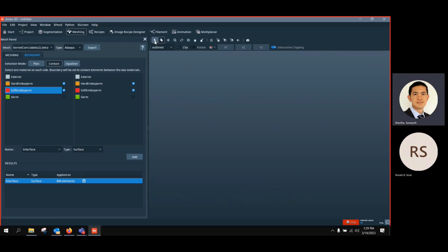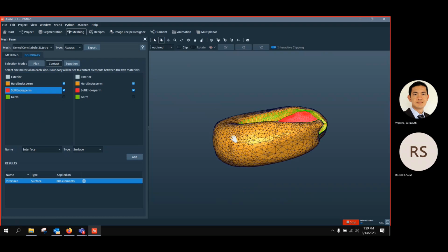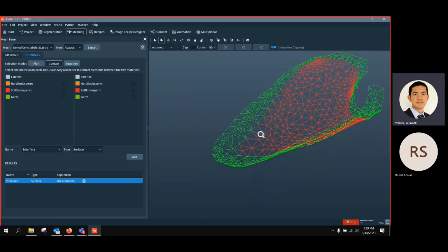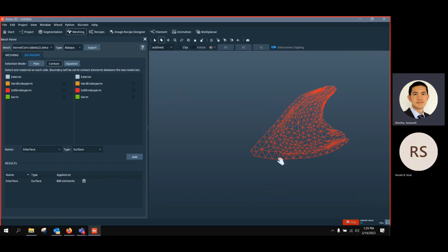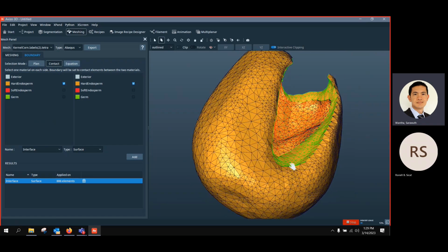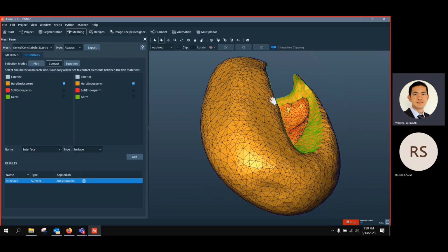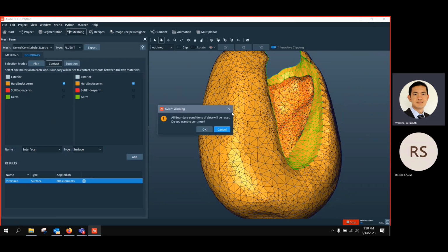So if I, for example, do like this, you can see that here is the one I selected, but the green membrane is the one I added before, and then I overlay this. This is the boundary condition at the interface between two layers, and this boundary condition can also be added and then exported to this object.